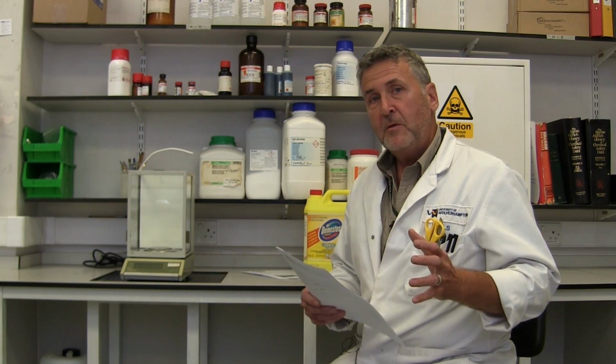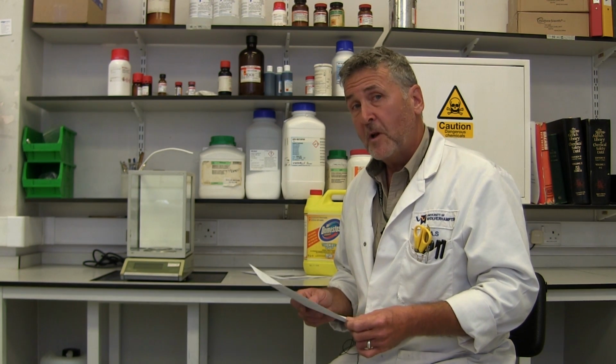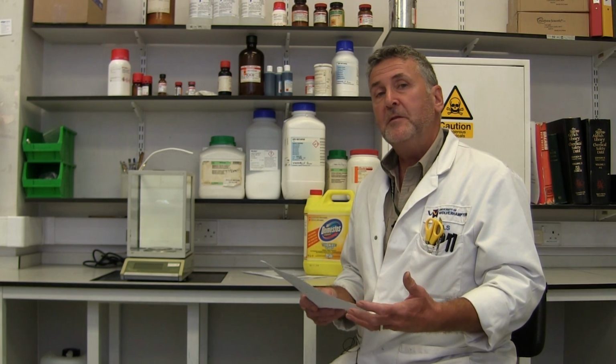What we need you to do though is to use common sense again. So you're using small quantities of chemical, therefore you use what I would call small quantity sense and follow those guidelines. But whatever you write down on the CoSHH form, you must follow. So if you skip certain things and you don't write certain attributes down, you may forget how to deal with that chemical if you spill it.